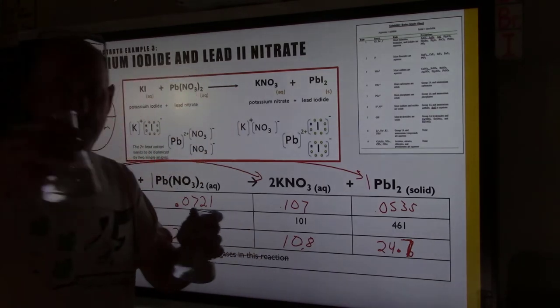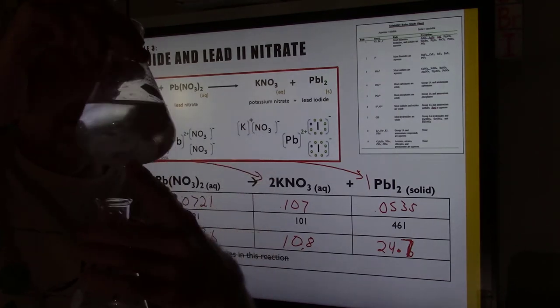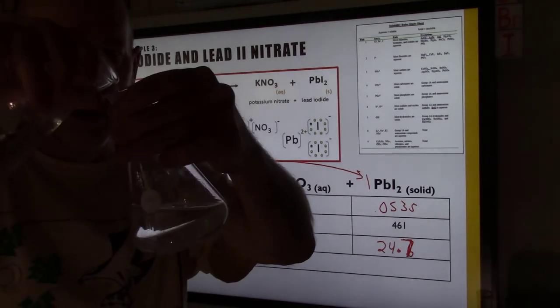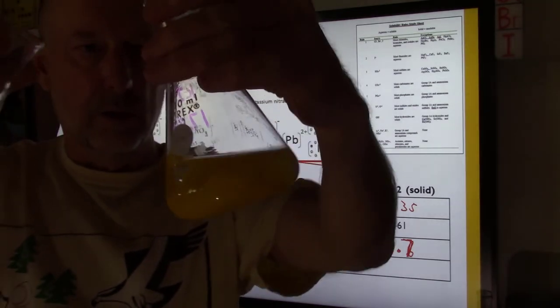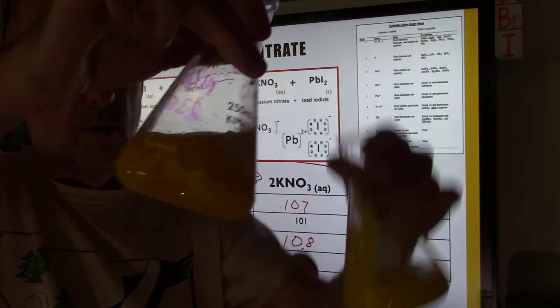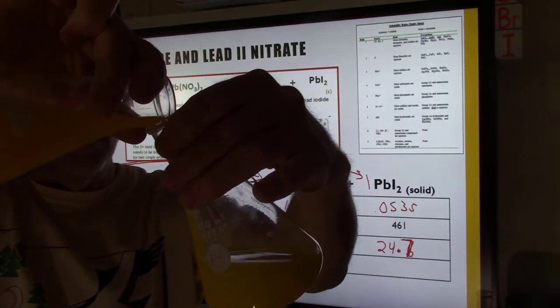And so let's see. It's a soluble compound. This one is soluble. I do have a little bit of, I put in too much lead nitrate here. Well, okay. Will a reaction occur? Oh, is that ever cool? One of my favorite reactions. Isn't that pretty? The yellow.